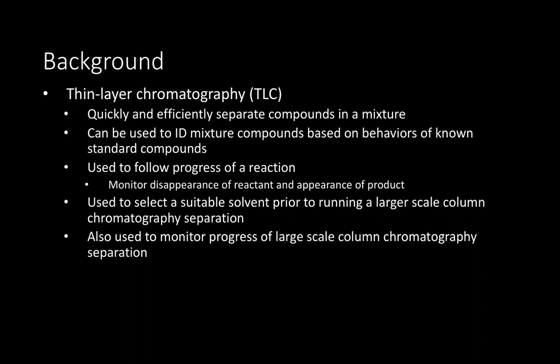It can be used to identify mixture compounds based on the behaviors of known standards and compared against known standards, especially. It will most often in a normal lab setting be used to follow the progression of a reaction. You can monitor the disappearance of a reactant and the appearance of a product pretty easily using this technique. We'll be able to do that next semester, actually, for organic too.